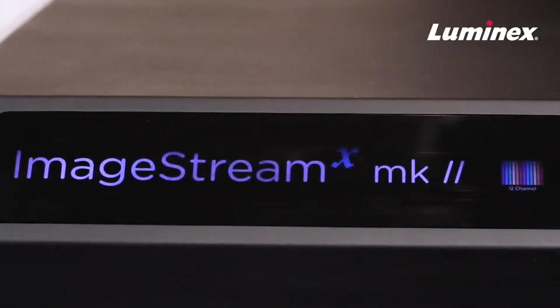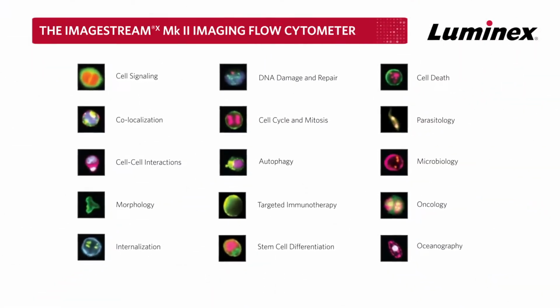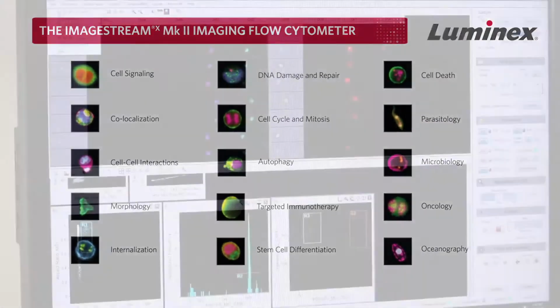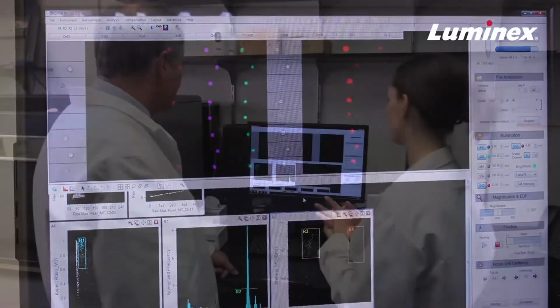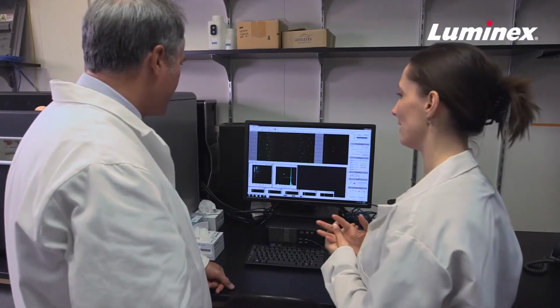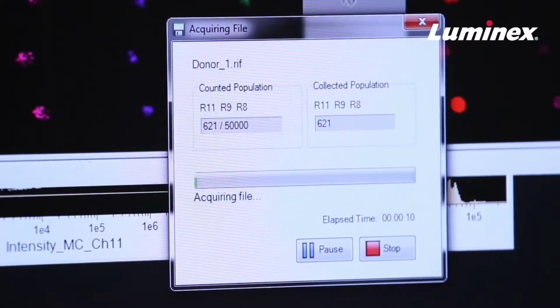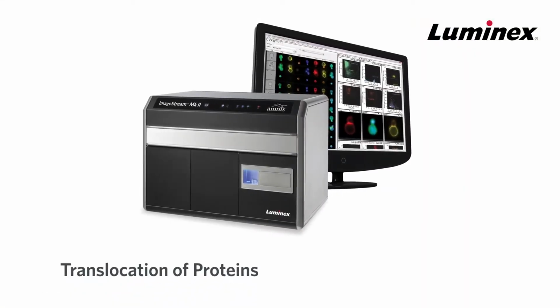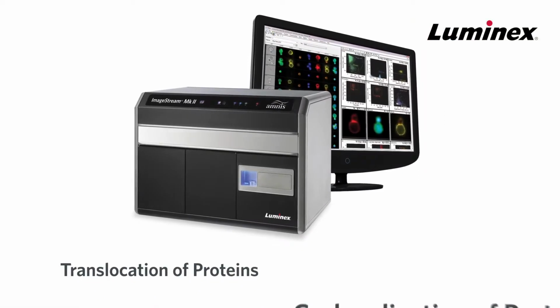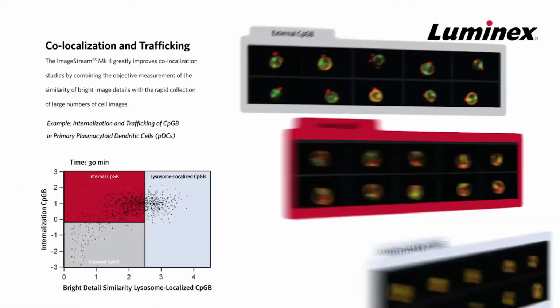With the ImageStream, you obviously get an image, and that's been a huge advantage because it allows us to actually see the cell. Now by conventional flow, what you're getting is an intensity for each marker. By the ImageStream, you actually get a vision of what's going on inside or on top of that cell. As a consequence, we can use it to look at translocation of proteins, we can use it to look at co-localization of proteins. That's really affected the way we do a lot of our analyses.